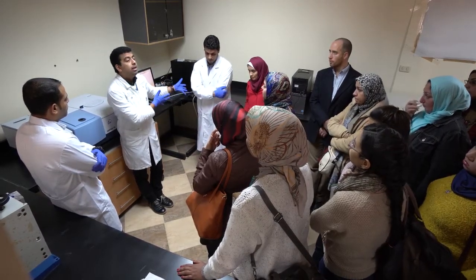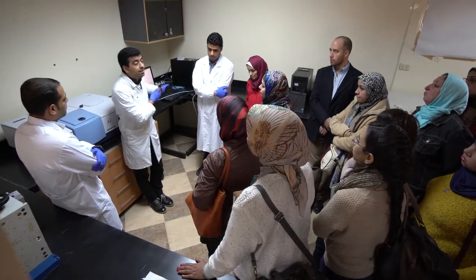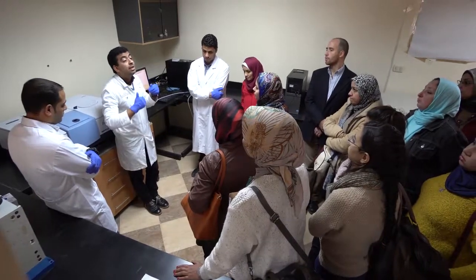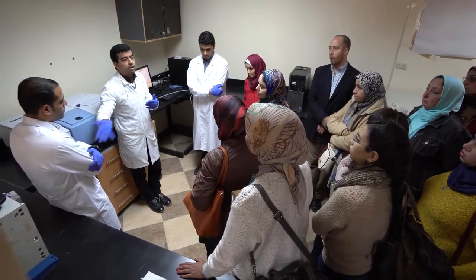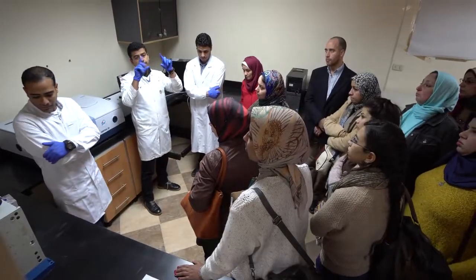And my colleague Karim will give you the instructions related to the ATR, how he is going to analyze, how he's going to get the data, how he's going to get the chart. So let's start with Osama to get the KBr technique, the destructive one.